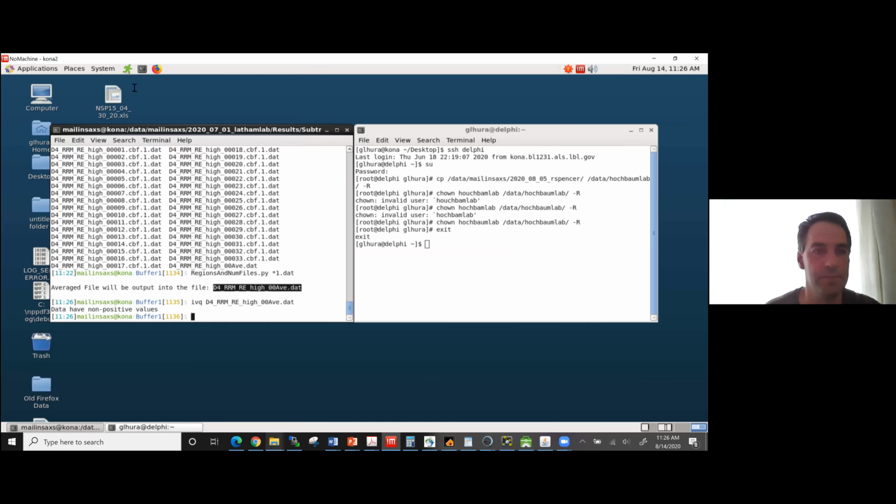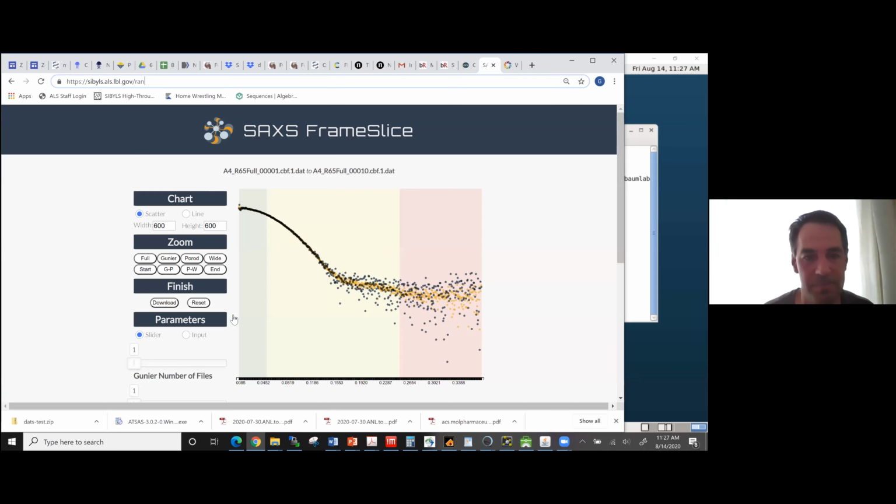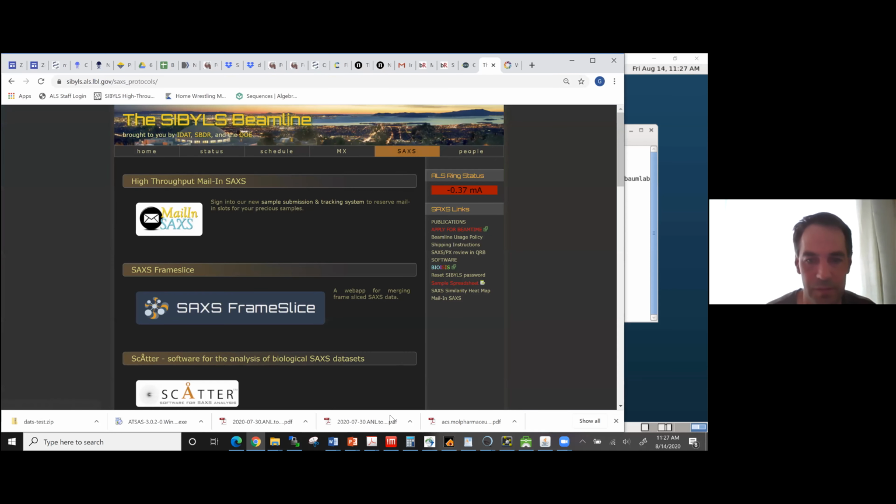Going to the web tools. Let's see. And again, this wasn't working really well for me today. And I think I'm just having a data lag. So sometimes the data is not being passed well.